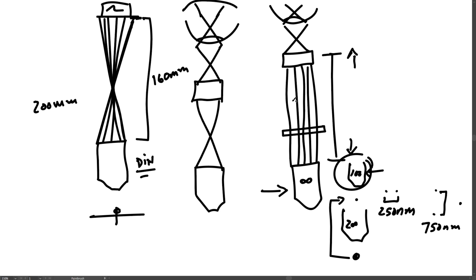And of course, if you wanted this dot to be bigger, then you can just blow that up in Photoshop to twice as large or 3 or 4 times as large. So you don't need a microscope objective to do that.